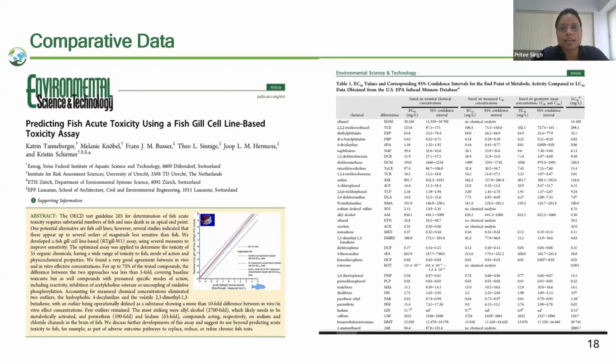And the neurotoxic chemicals, which act on ion channels, sodium and chloride ion channels, were also not giving a proper result, with around 190-fold or 63-fold differences for some chemicals, as they have mentioned here. So for neurotoxic chemicals and chemicals with endocrine-disrupting properties, this assay, OECD 249, is not up to the mark. But for other chemicals, we can rely on the data, we can compare the data, and we can say that they are accurate.